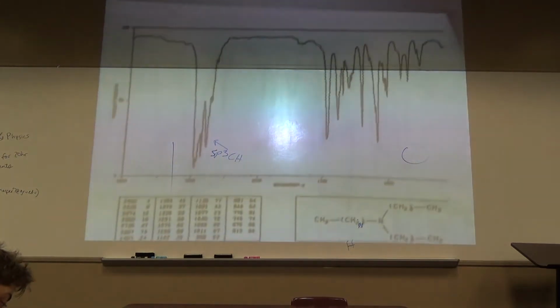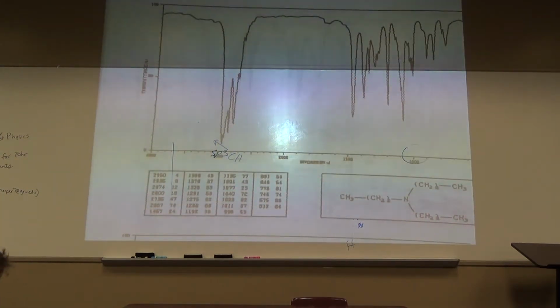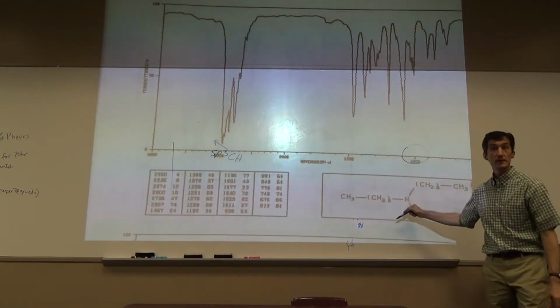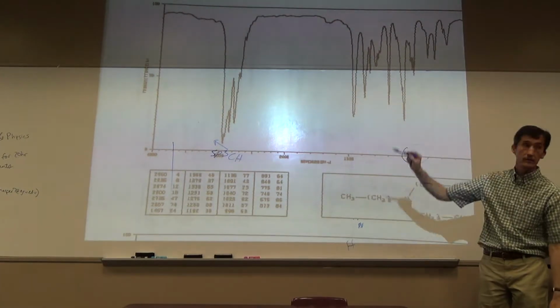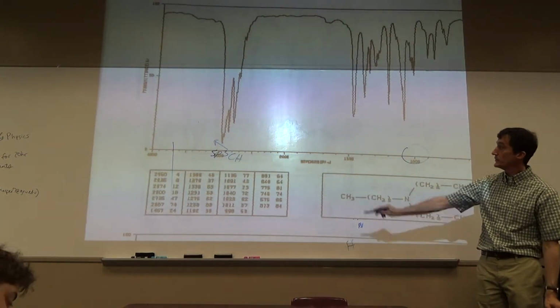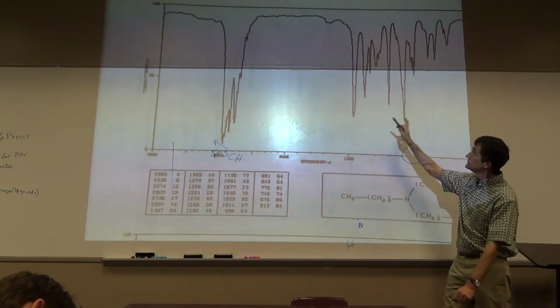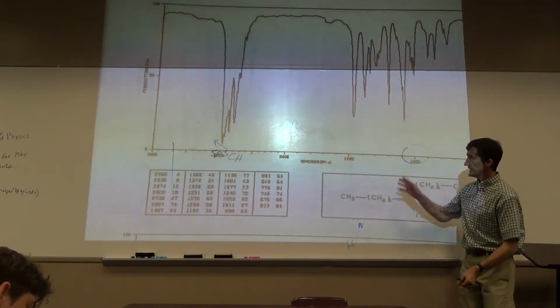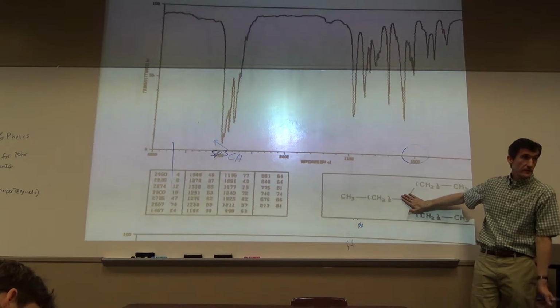And what type of an amine is that? Tertiary amine, how many NH peaks do you expect? Obviously no NH peak, and there's none there. We do have the sp3 CH. I mean, you can't even tell the nitrogen's in the compound from the IR.